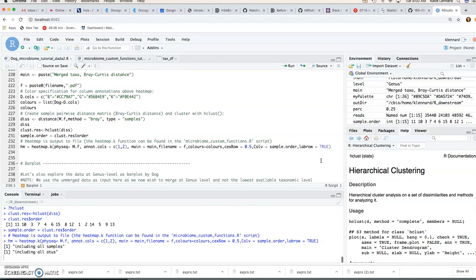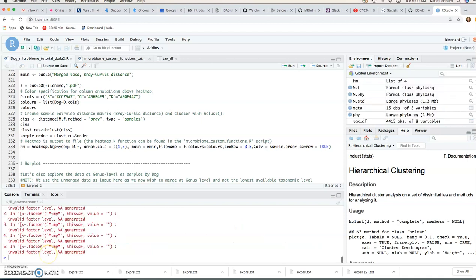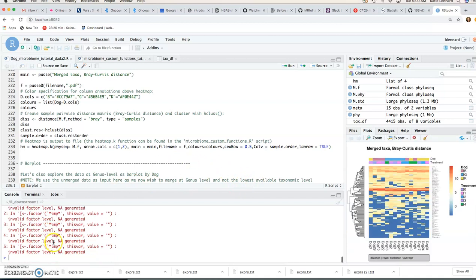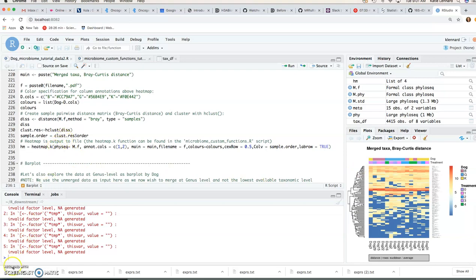So you can run that function. Tells you it's including all samples, all OTUs. And you can ignore the NA messages and then it should create this plot here for you in the window as well as save it to file.